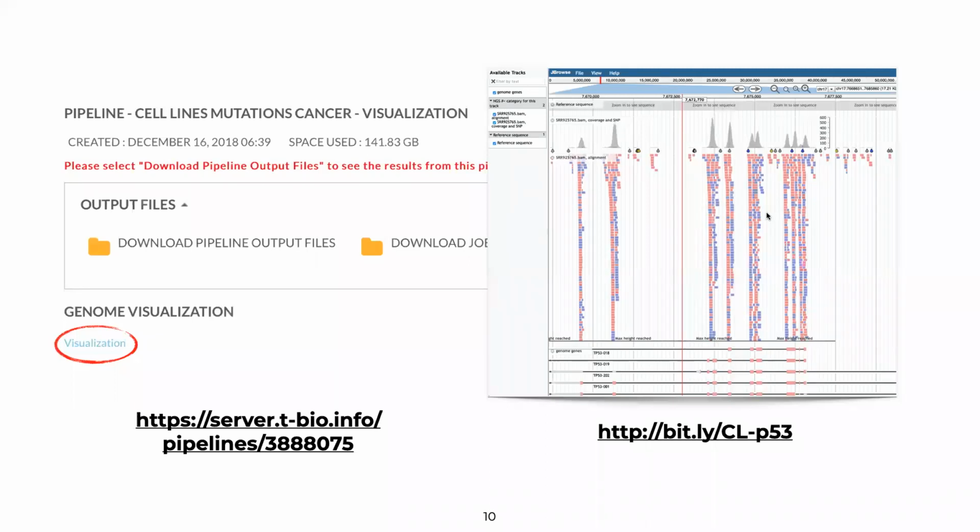Short reads aligning to specific regions, targeted or exome. Okay. So it is whole exome sequencing. Why do we know that? We know that indeed the reads are not aligned everywhere in a uniform way. We only see them in specific regions. Now, how do we know that this is actually exome sequencing?